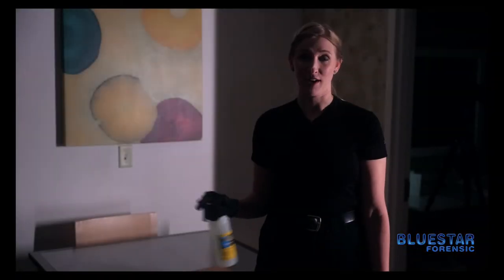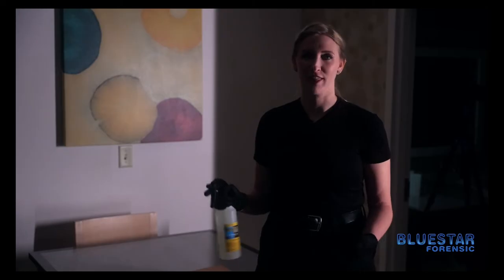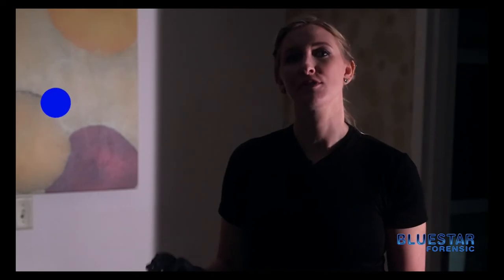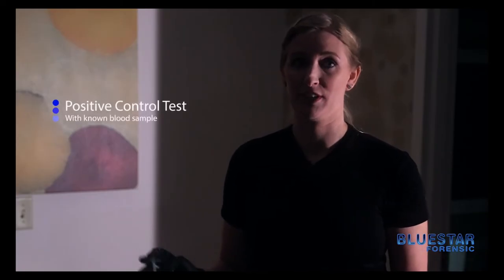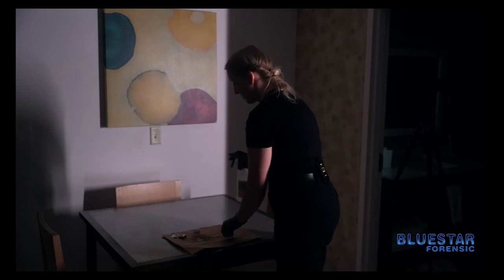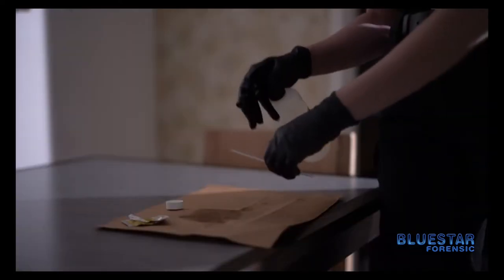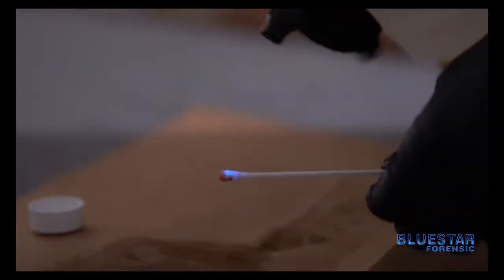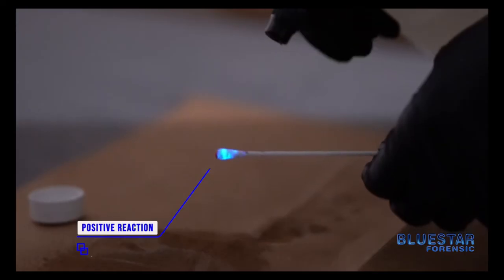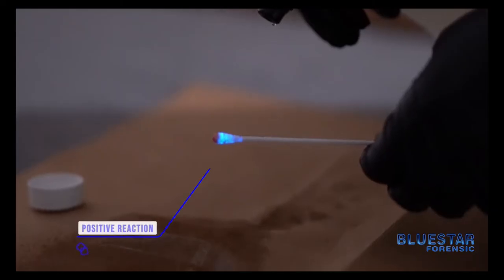Before using any product on a crime scene you want to make sure that the chemical is working the way it's supposed to. So in order to do that we're going to use a known blood sample to make sure the chemical is working properly. We also will dim the lights a little bit so that we can see the reaction. As you can see the chemical is reacting the way it's designed to — you see a blue glow from the known blood sample.